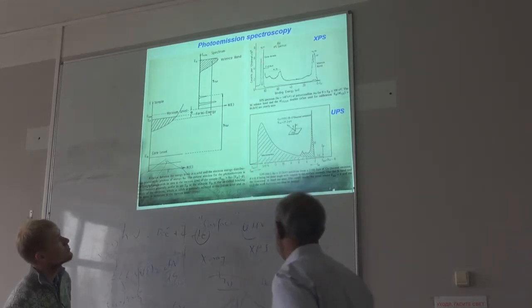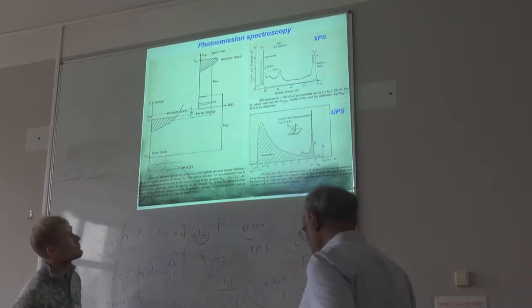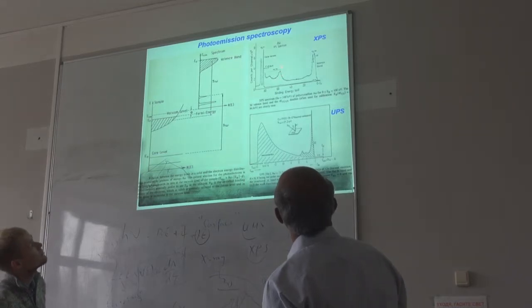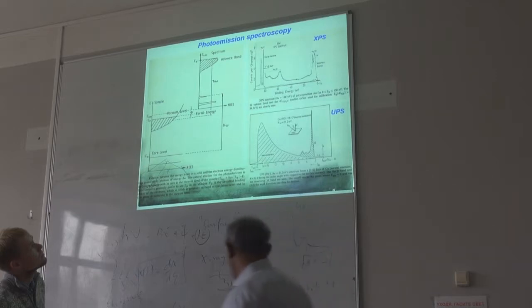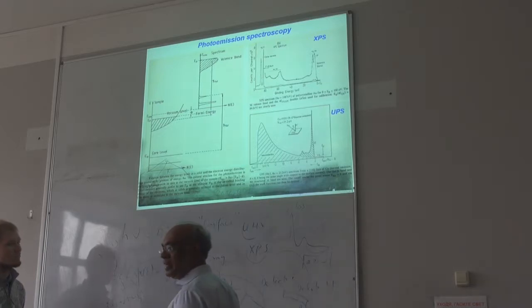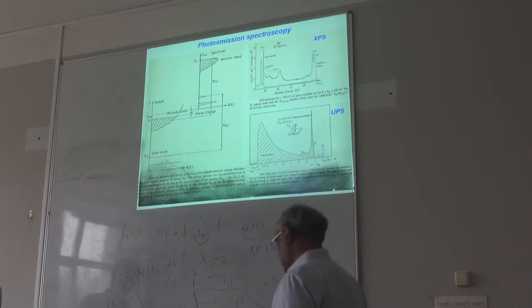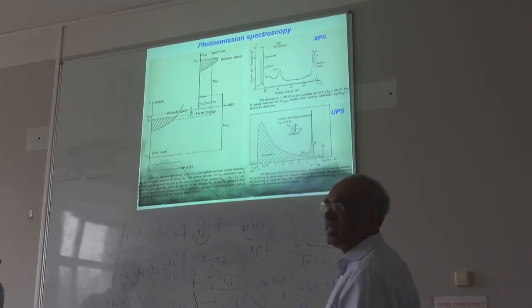So from any energy level, you can see the electron energy in the XPS, or even gold 5p. Everyone is familiar with s, p, d, f. Each level has s, p, d, f sublevels, right? So if any electron is coming from a p level or d, f, everything you can see from the XPS spectrum. That's a very easy thing to do.